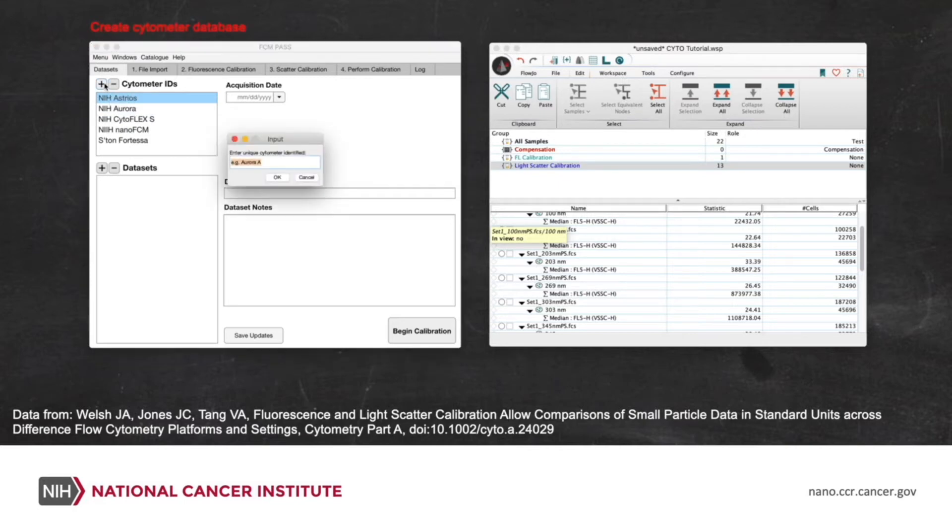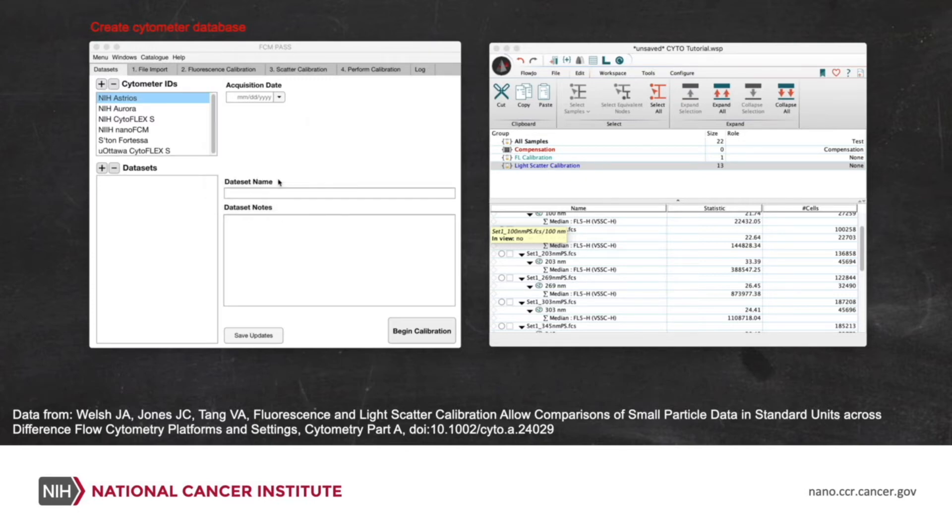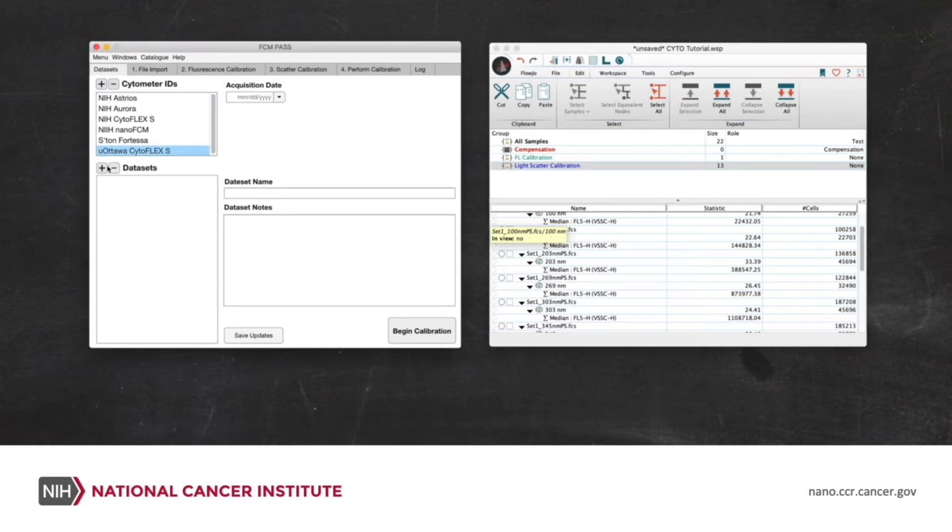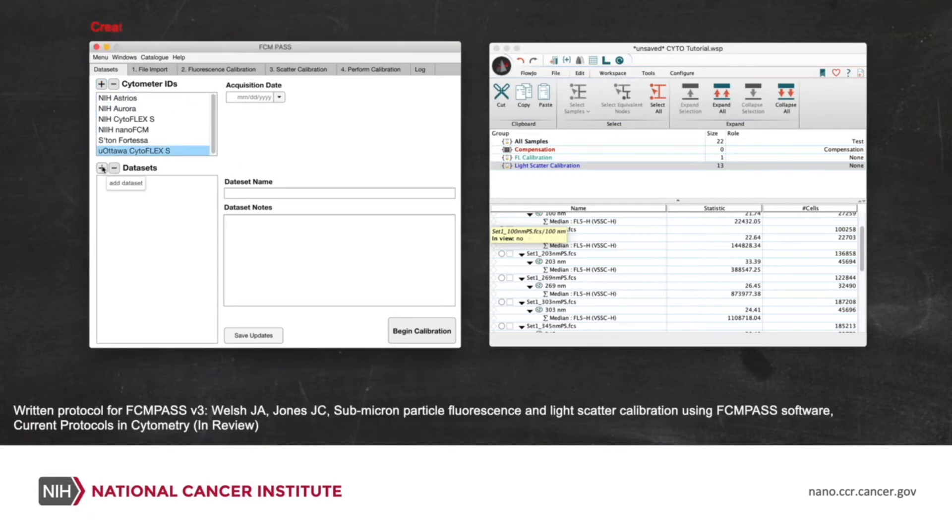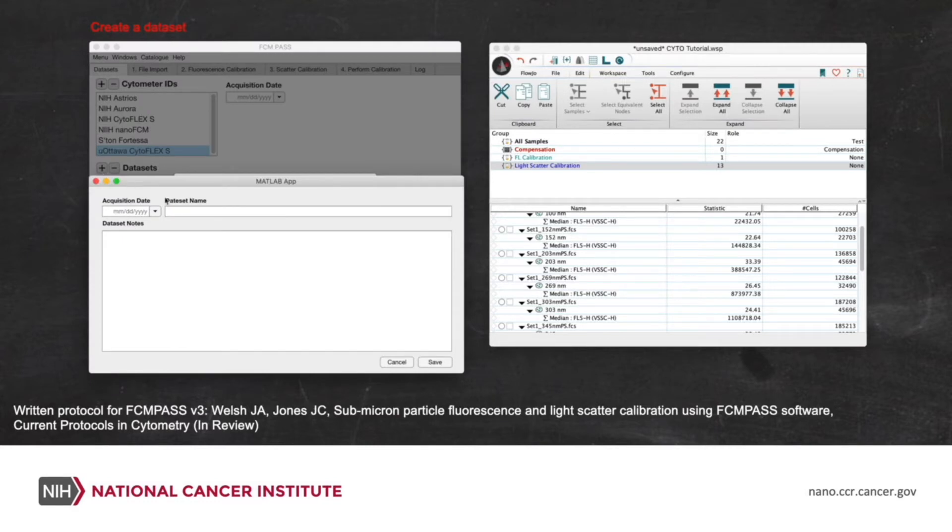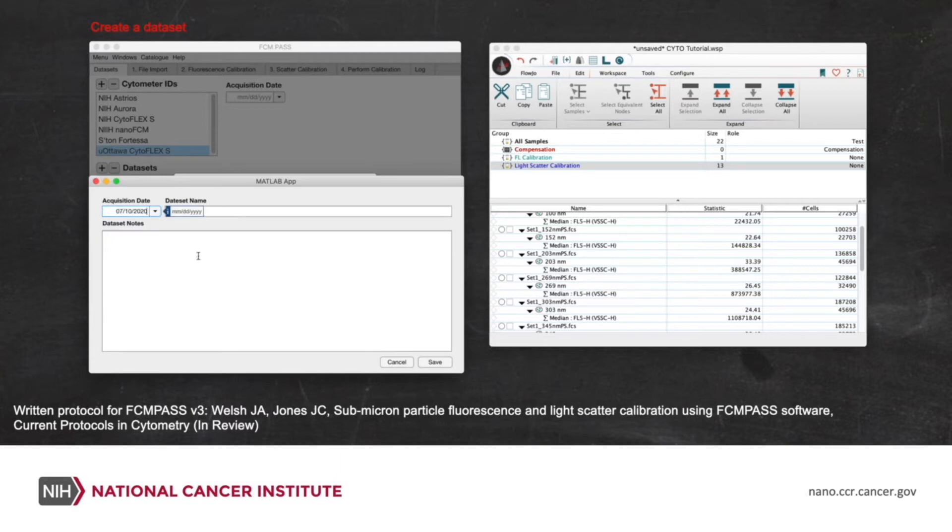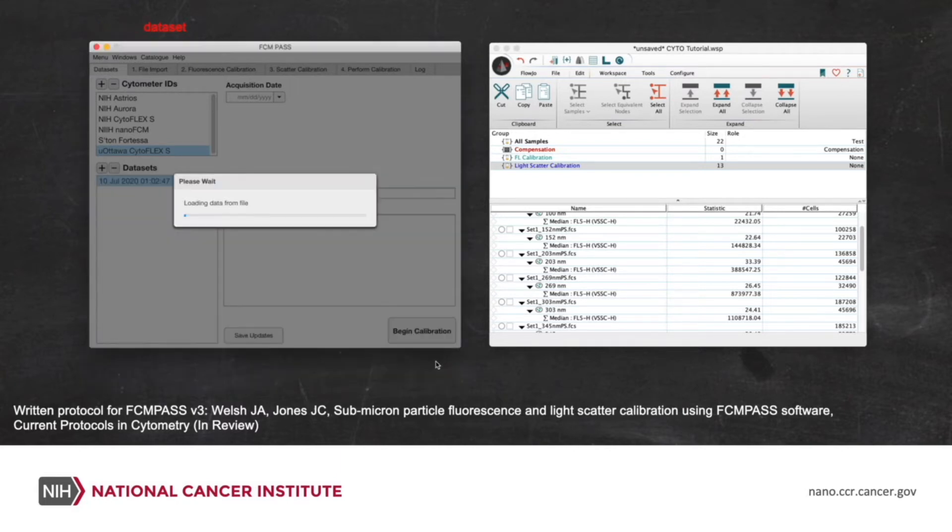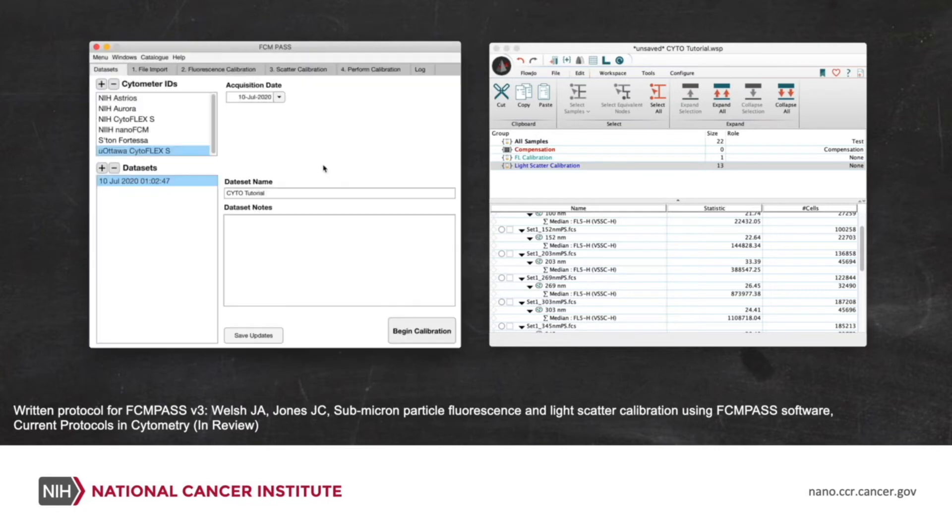We're going to add a data set now, a database. This is the University of Ottawa's Cytoflex S where this was generated. So we'll create a cytometer where we'll store this data set. We'll click on the cytometer and now we'll add a data set. This database is made so that you can track your data sets through time for each of your instruments, which will help you keep track of your experiments, but also your instrument sensitivity. So we've now created a data set.